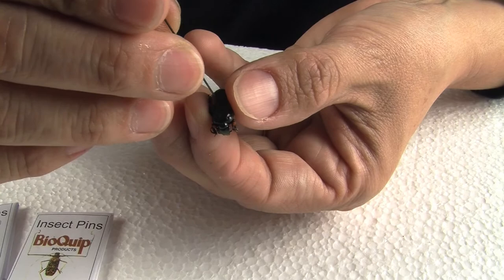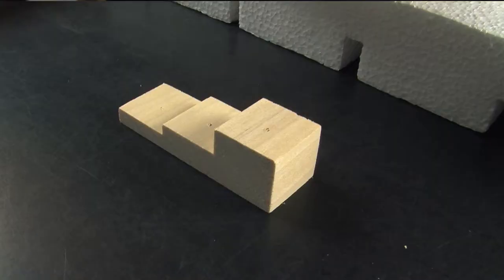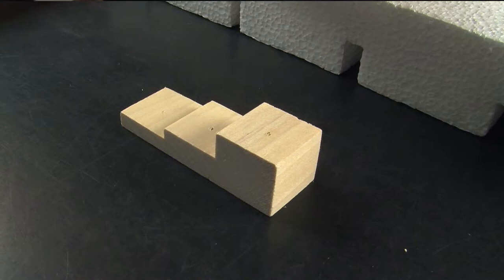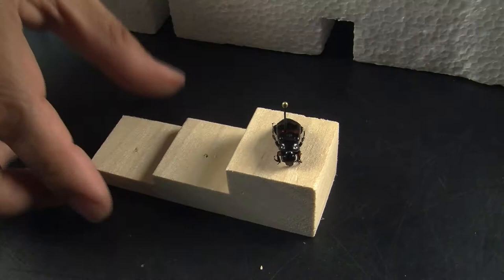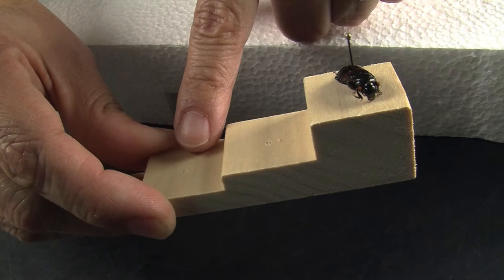So hold the insect tight through the abdomen, mark it on the center — the second thoracic segment, slightly from the center to the right. Have your pinning block ready on a solid surface, because you don't want the pin to pass through your soft surface. Your pinning block has three different levels: the first is where the height of the insect will be, the second is where your first label goes, and the third is where your second label goes.